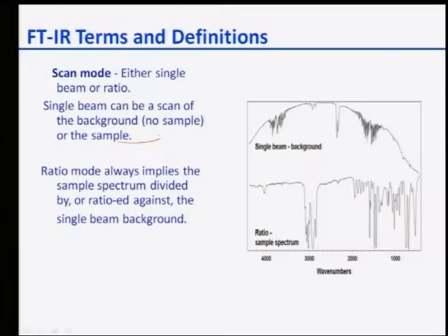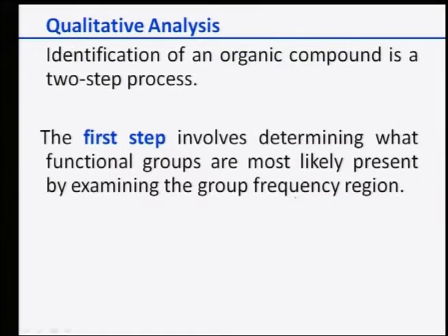Here is a single beam background, which is obviously very bad, and you cannot fit it. You can clearly see the background here, but in ratio mode the background is very good, so your signals can be easily seen. As I said, these are the basic things about FTIR you need to know.